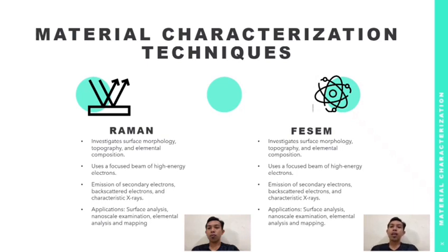Field emission scanning electron microscopy, or FESEM, is a powerful technique for imaging and analyzing materials at a nanoscale. It provides high resolution images and enables detailed examination of a material's surface morphology, topography, and elemental composition.